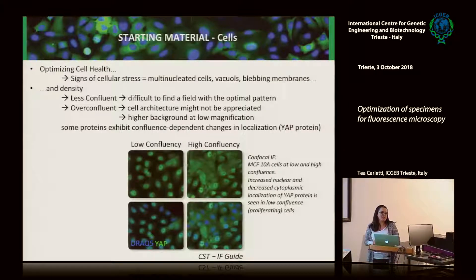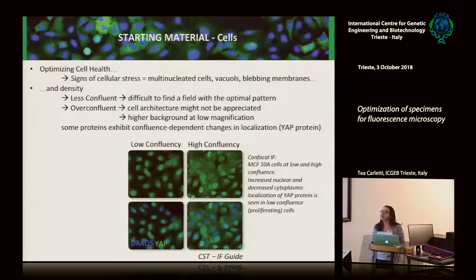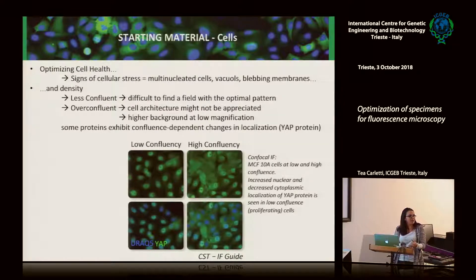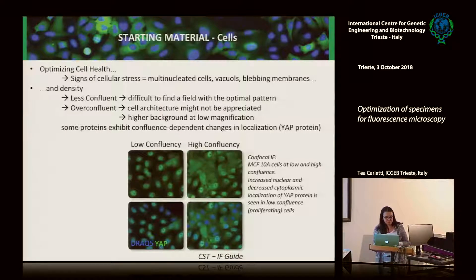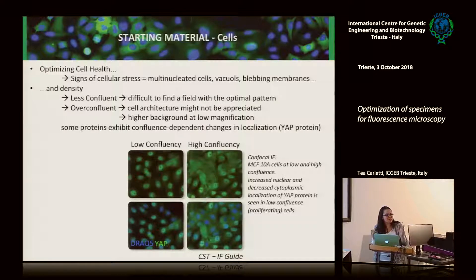Be sure that your cells are healthy. You don't want information from a population of cells that are going to die. You can easily see signs of cellular stress under the brightfield microscope before starting fixation and permeabilization: multinucleate cells, vacuoles in the cytoplasm, or blebbing membranes. At that moment you should stop and decide — should I repeat, should I continue?